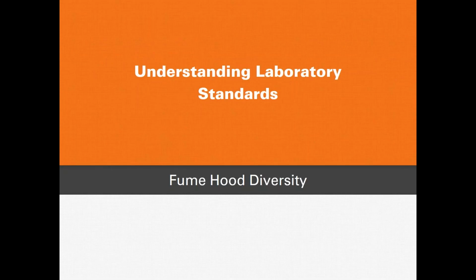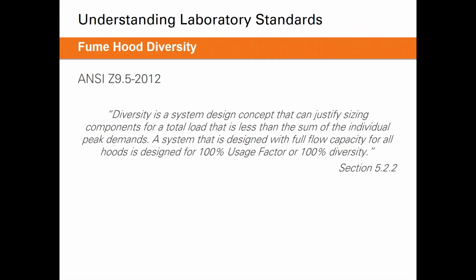The next topic we'll discuss is fume hood diversity. Fume hood diversity can be a great way to save energy and save installation costs, but it is very important that it's implemented correctly. We'll go through how ANSI Z9.5 describes diversity, as well as the important steps that must be taken to properly implement the concept.